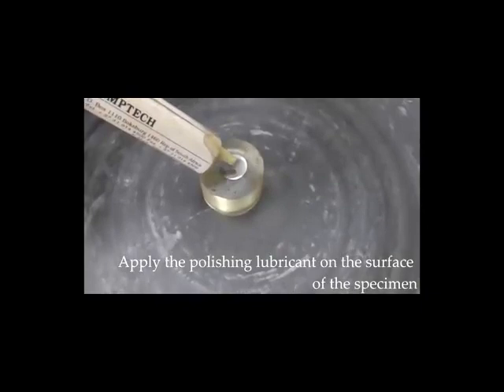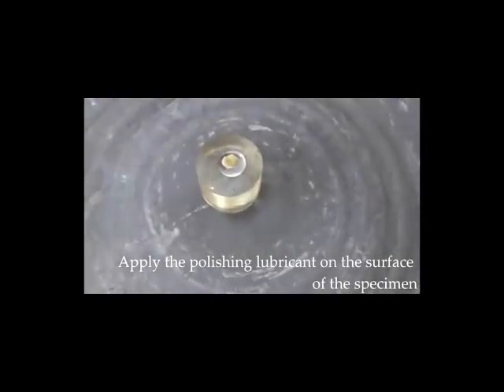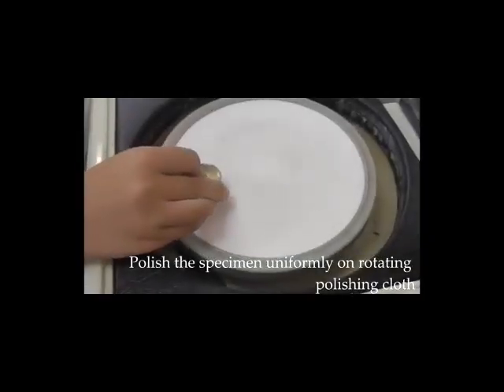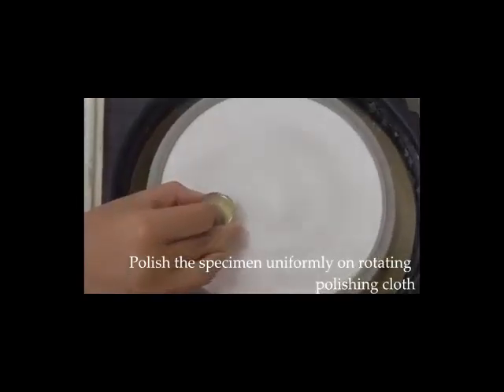Apply the polishing lubricant on the surface of the specimen. Polish the specimen uniformly on rotating polishing cloth.